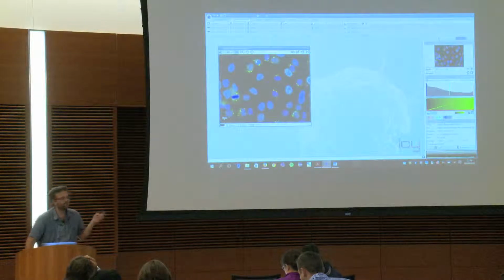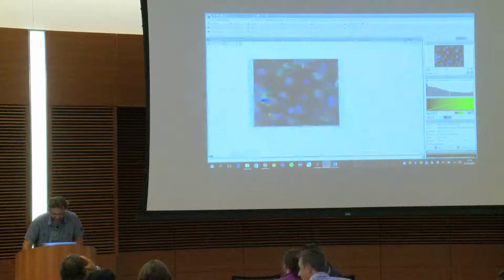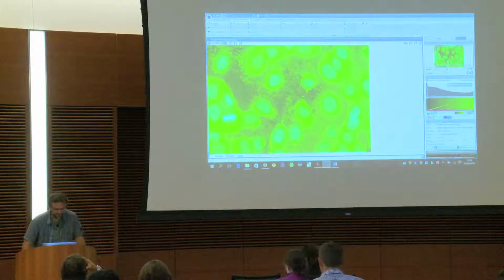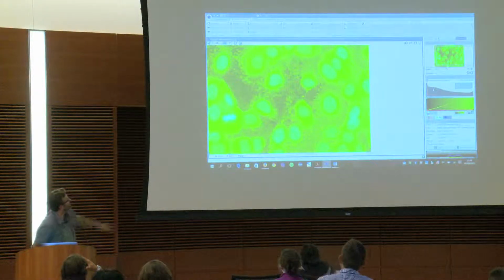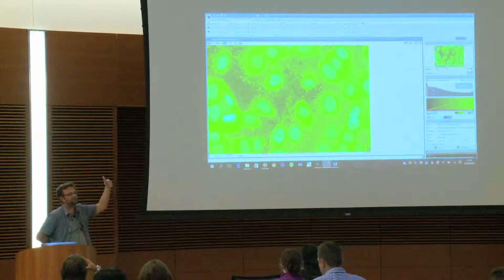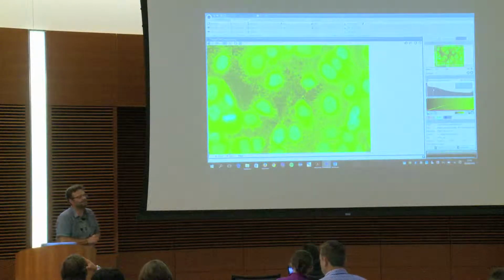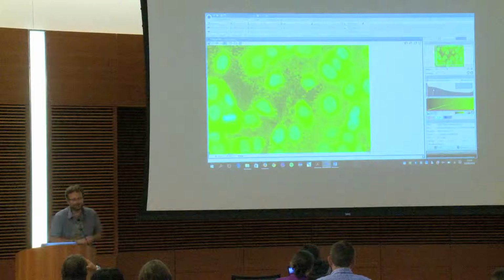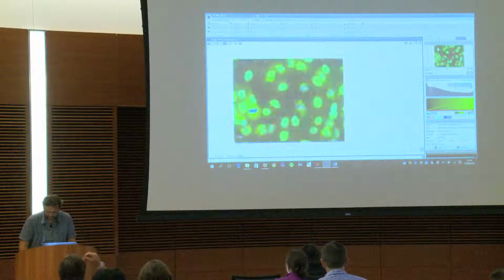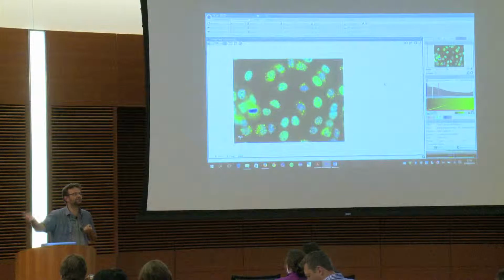So this morning we told you that JPEG is bad, and it is incredibly true. Here, if I have this image and I take my green channel and I push it a lot, you see the kind of background that we have. There are a lot of squares, and of course the squares don't exist. It's just the system creating the squares to simplify the data a bit, and then it's more efficient to save the image.